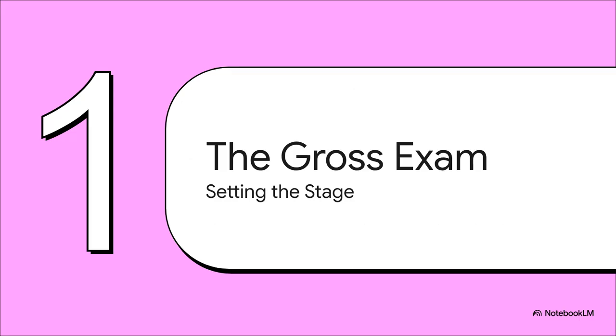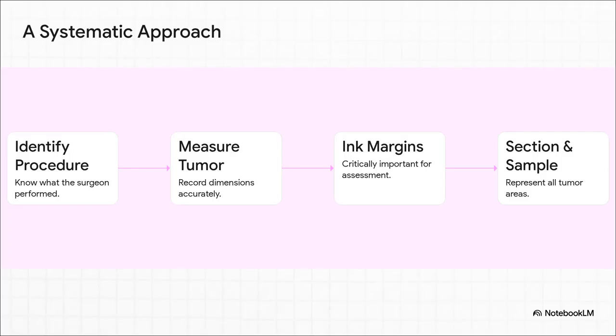You know, everything really starts at the cutting board. The work you do during the gross examination literally sets the stage for the entire report. If you get this part right, everything else, from the microscopic exam to the final stage, is going to be built on a rock-solid foundation. Having a system here is completely non-negotiable.